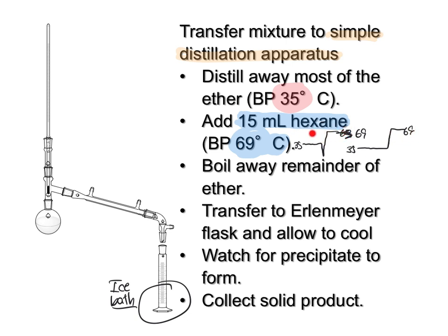At that point, you want to stop your distillation and then transfer the contents of the round bottom flask to an Erlenmeyer flask and just allow it to cool.